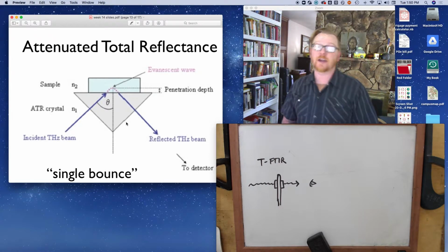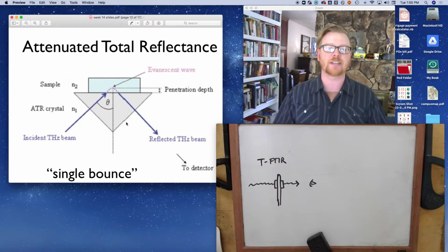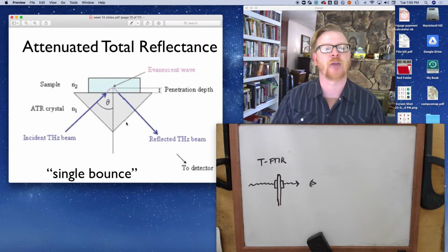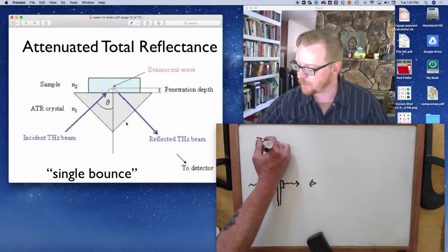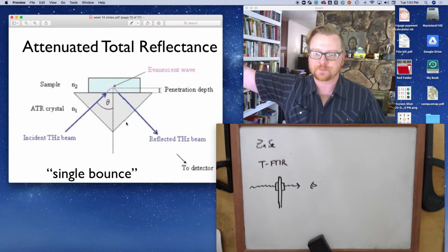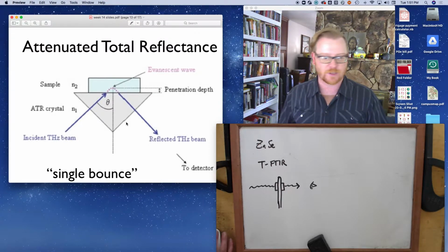The one that you guys use upstairs is actually a diamond crystal. It's pretty cool. It's very expensive, crazy expensive, but it's not going to get damaged. It's IR transparent. There's not a single solvent that's going to dissolve that diamond crystal. So that's pretty typical. Other ATR crystals that are common are zinc selenide. That's actually my favorite. Zinc selenide is not as strong as diamond, but it's chemically inert, which makes it really useful, and I'll tell you why in a moment.